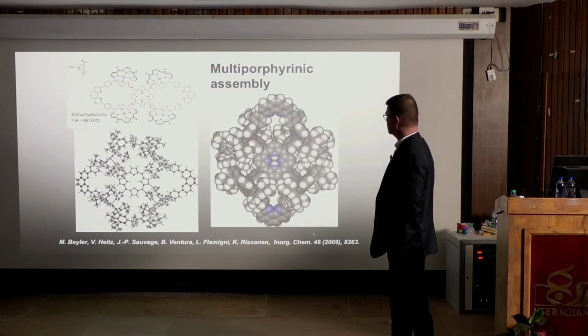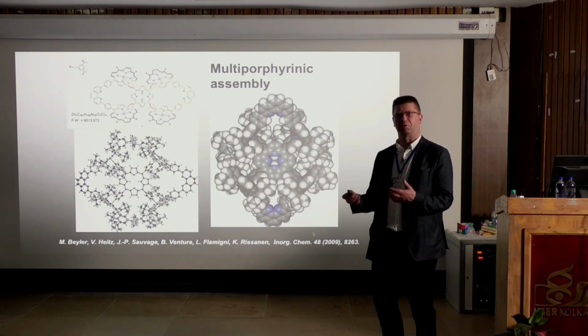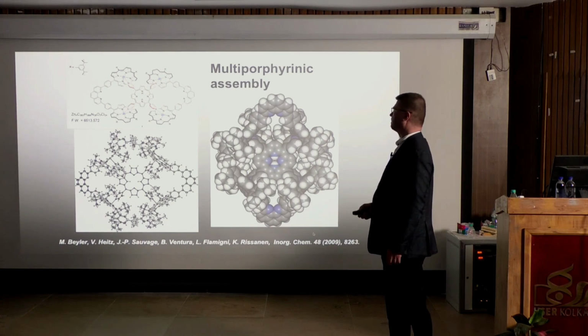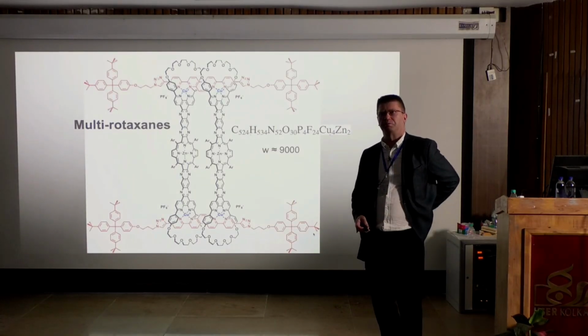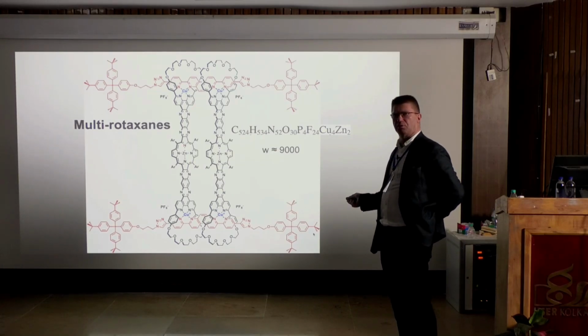So here there is really a tiny hole in this area. Here it's huge, but now you can see that it's actually a very tiny one. But that's the case. So now we can have a structure at atomic resolution for this. But then the idea is that he sent me this. So it's a very impressive molecule.